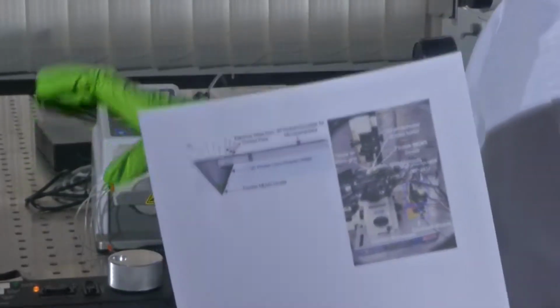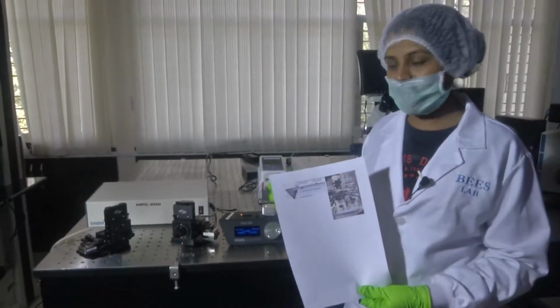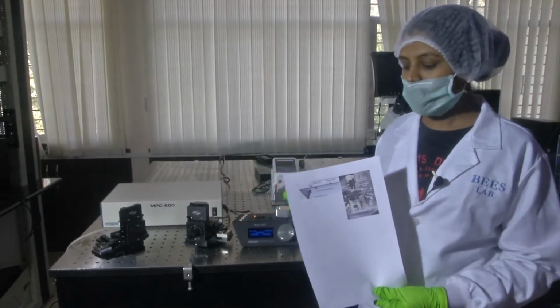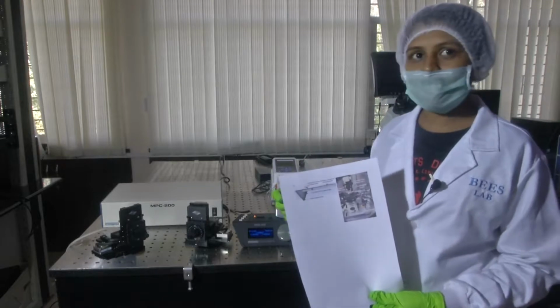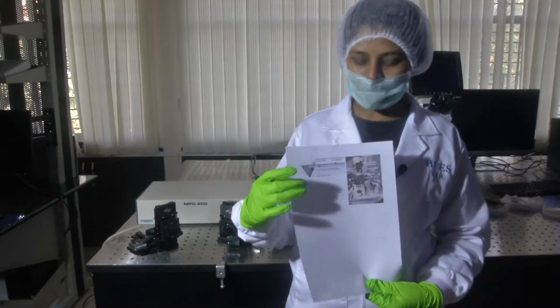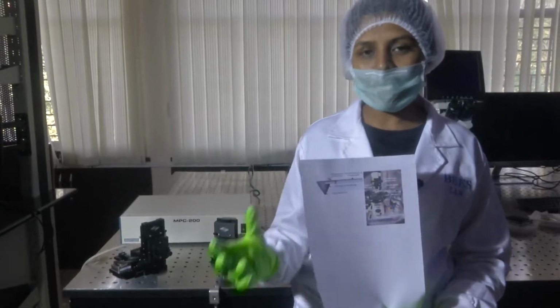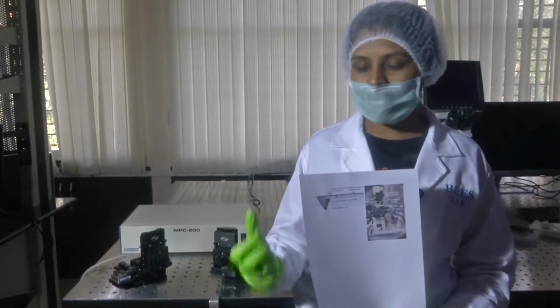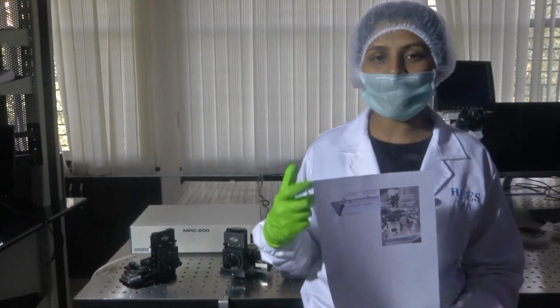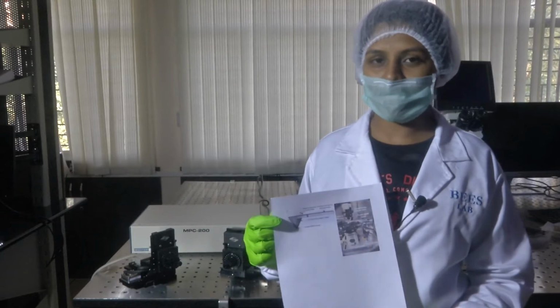Hope the entire demonstration about the use of micro manipulator would help you understand the purpose of using the manipulators for fine precision, control and repeatability. All of these advantages are why we use micro manipulators to do the indentation, or otherwise you could also use them for single cell manipulation, multiple purposes. So, these can be used for a fine control over your movements while you do your research. So, that was the detailed study about the use of micro manipulators. Thank you.